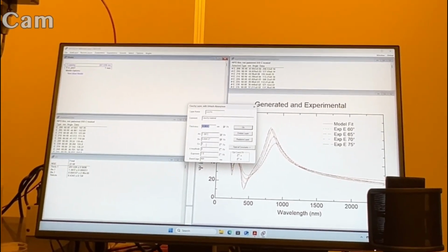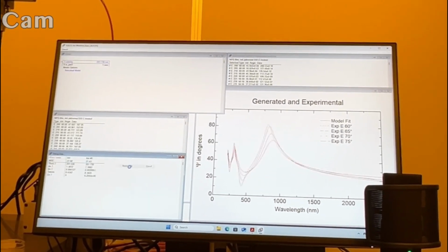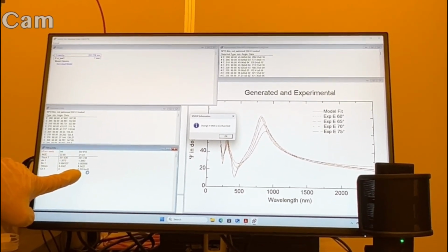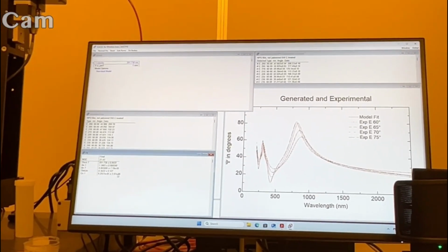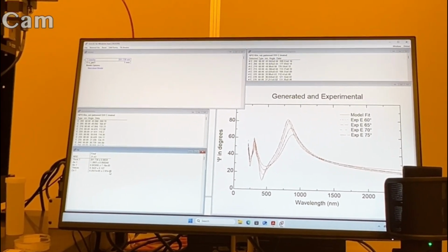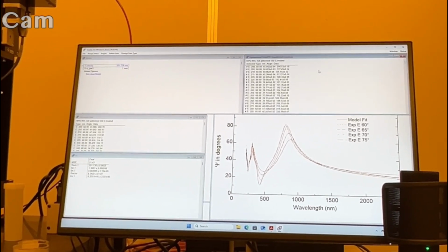Since it's that wide of a range, we might try the C parameter to see if that cleans it up a little bit, but it really didn't help. So same MSE, almost. C is so small. It's essentially the same model both ways. At least the error bar here is less than the value, but it's maybe like 20% of the value. So with or without C in this case, it doesn't matter.